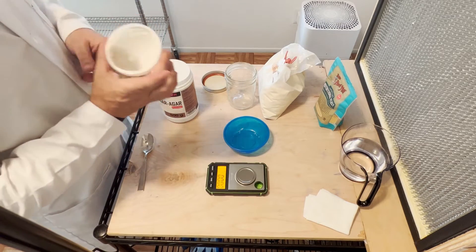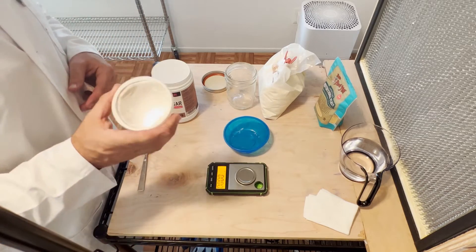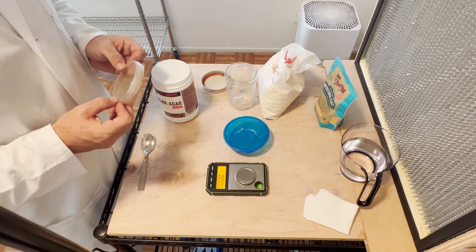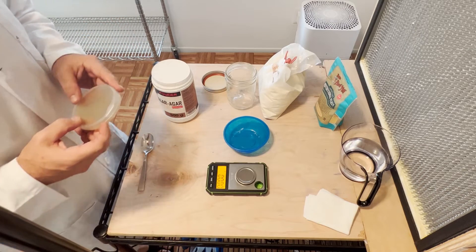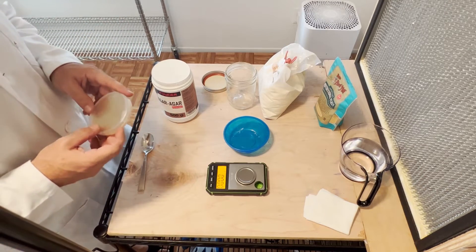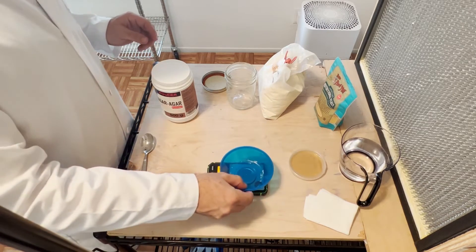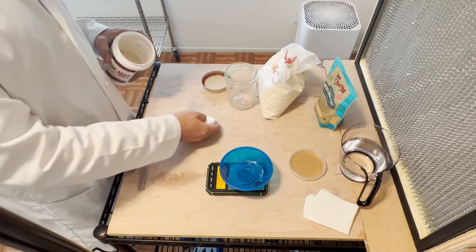The recipe to make 10 of the 90 millimeter plates is: one and a half cups of water, 7.5 grams of agar agar, 7.5 grams of dry malt extract.